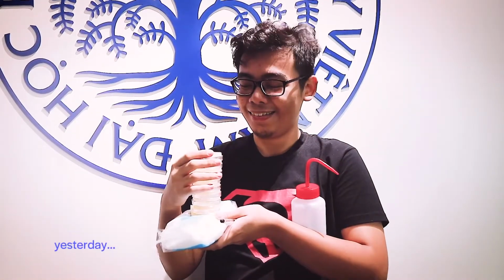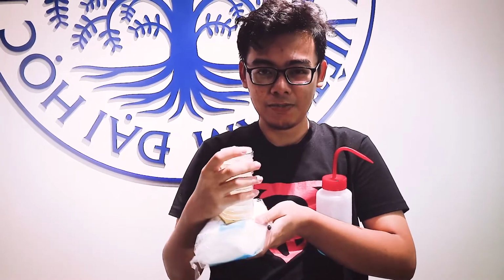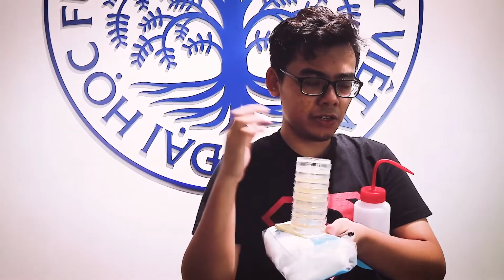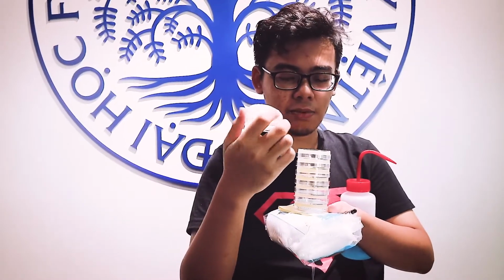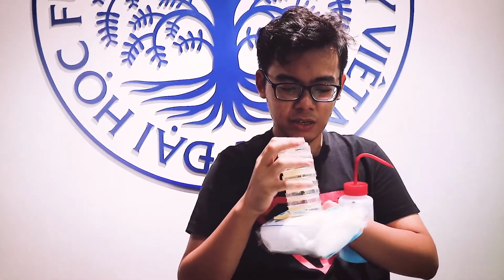While waiting for this to finish, we will move to the incubator that we have prepared yesterday. Hi, so we're here at Fulbright University, and we will go to places that are the dirtiest in this school and see how filthy each place is. Now I prepared some tools for this. Let me introduce this first, agar plate. This is a plate to grow bacterial colonies on.